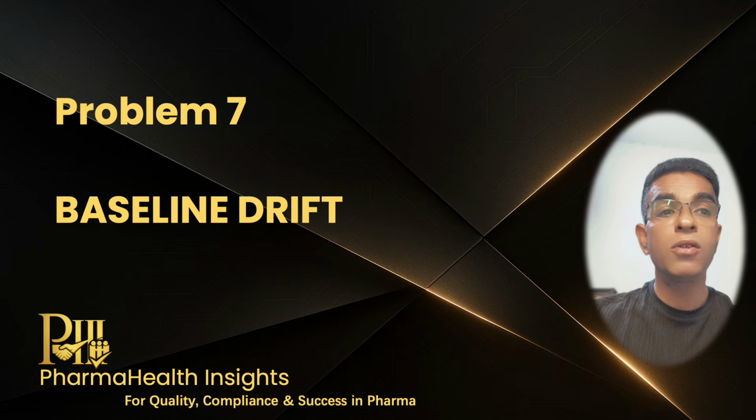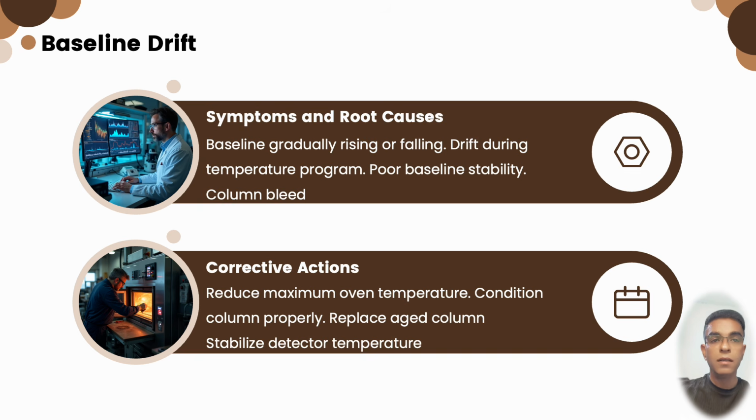Sometimes the baseline is not noisy but slowly moves upward or downward. Let us understand that problem next. Baseline drift is commonly observed during temperature programmed methods. The baseline slowly increases or decreases instead of remaining stable.